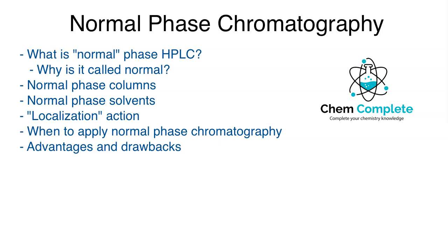And with such an uninspired name, and its very basic sounding terminology, you would think that we should have covered this at the start of the HPLC lectures. But some of our prior lectures on things like reverse phase and ion-based HPLC came first because they are actually more common than normal phase HPLC is.